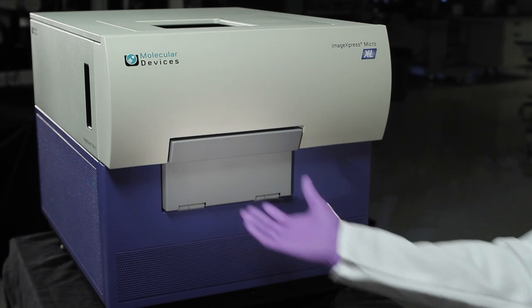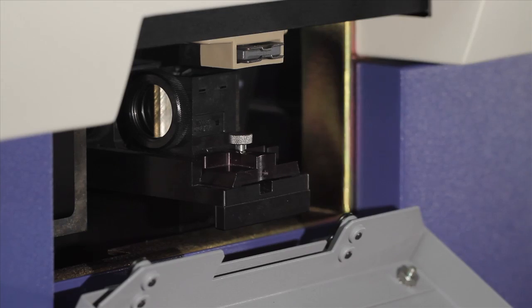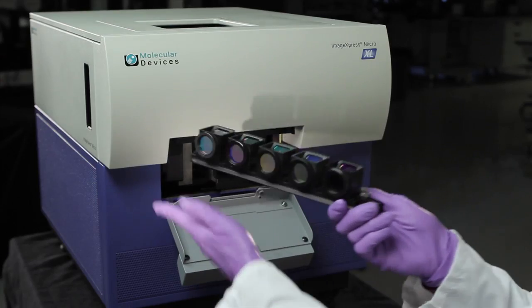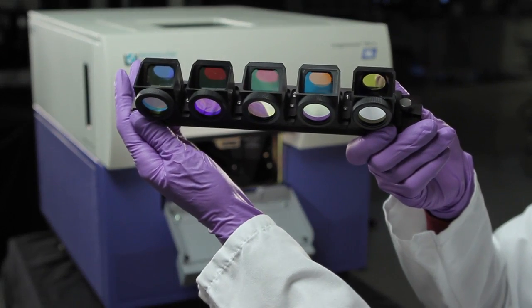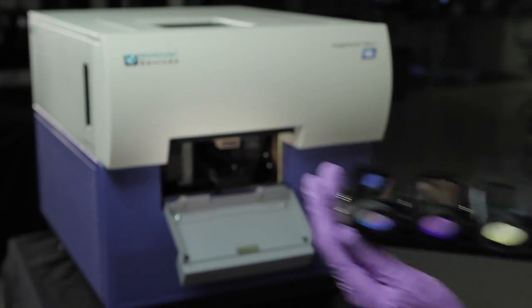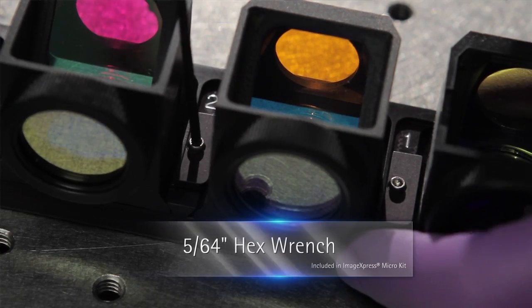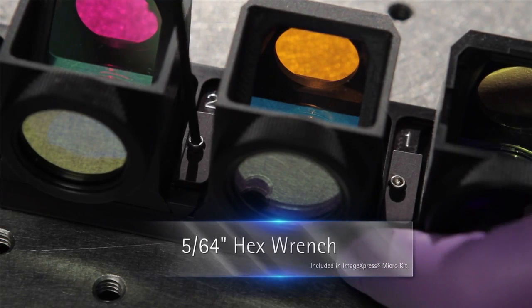While wearing gloves, pull open the filter door. Pull up on the spring lock to release the filter rack, then pull out the filters. Using the Allen wrench included in the ImageExpress accessory kit, loosen the screw to the left of the filter cube you want to remove.